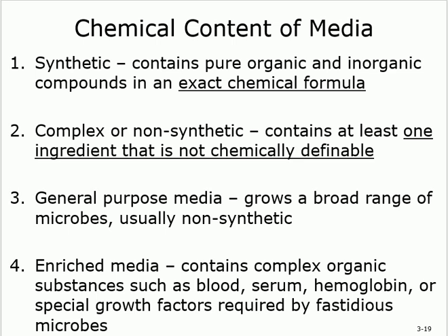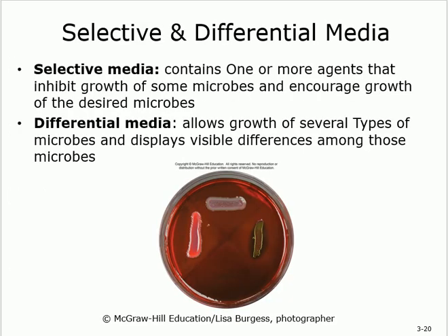This contains the organic substances, basically. They get it from different sources, but at the end, high nutritional value, and you add growth factors to it. Is that clear? When do we need the enriched media? If you need to grow something very fast. You have an hour to tell me exactly what kind of organism we have here, or the patient will die, for example.